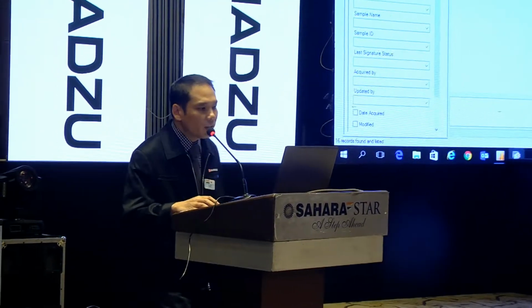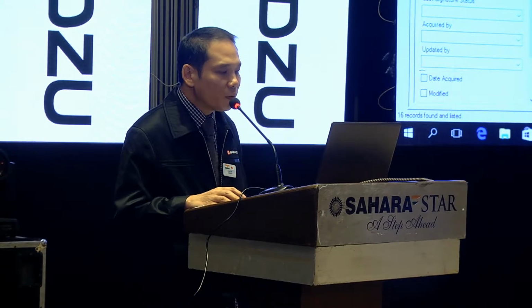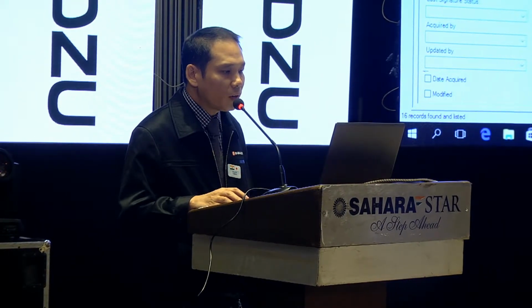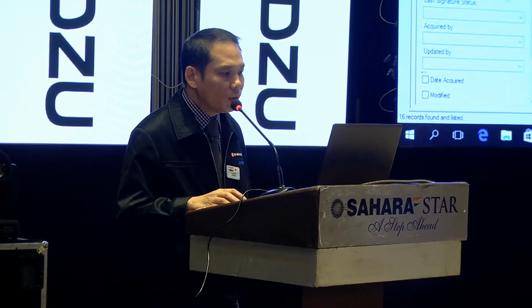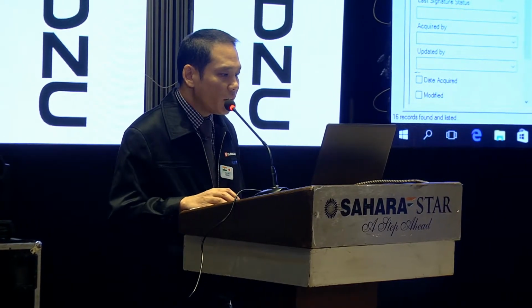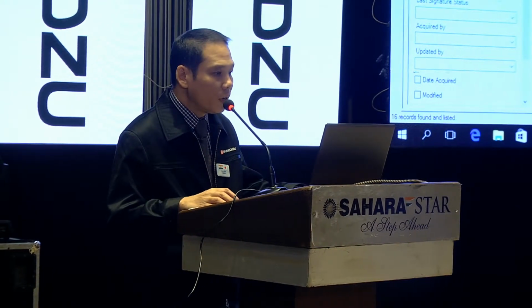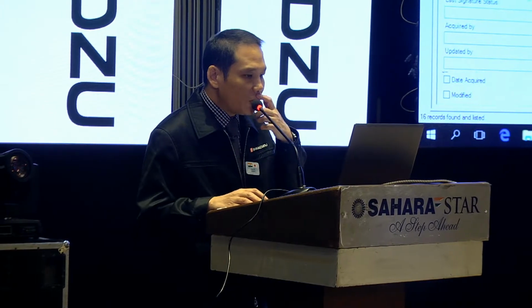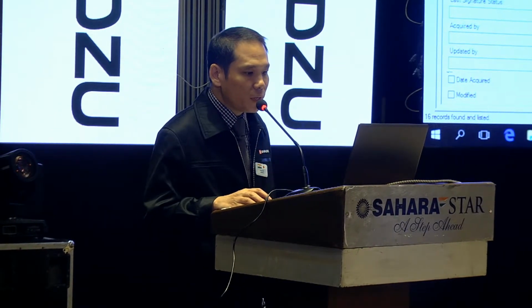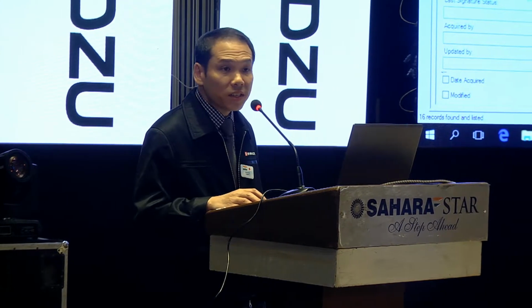Okay, see? So registered by Sanjay. All this information is recorded with the Lab Solution Data Manager. So the date acquired, acquired by who, modified, updated, the instrument number, which PC acquired this data.